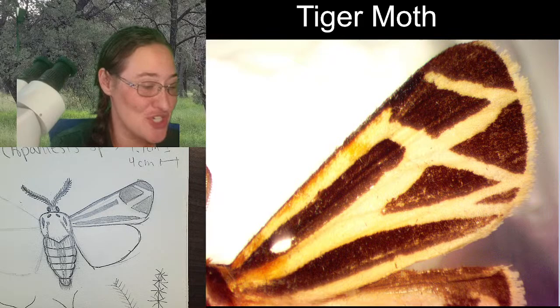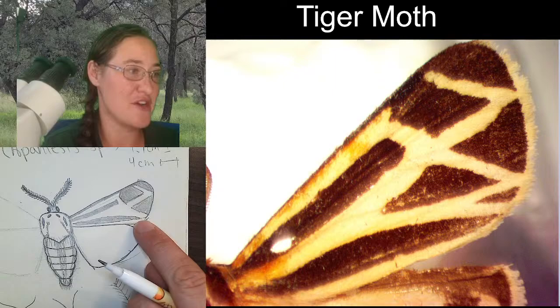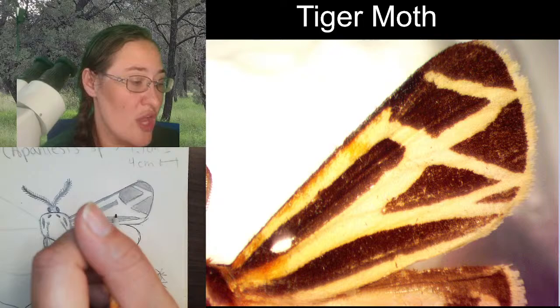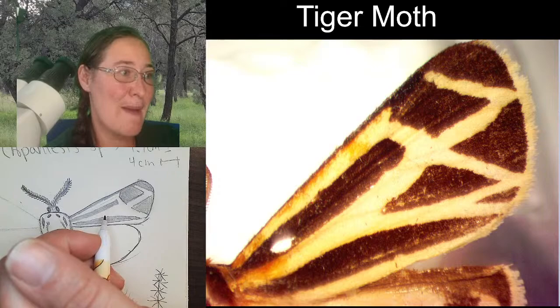But if I was just going to throw a guess out there into the ether about the fringe-like scales on the ends of the moth wings, I would imagine that while they are flying, they are kind of like blowing in the wind this way. And also, these are night-flying creatures, so they are trying to avoid bats. And I would throw out a guess that those fringed scales on the edges might mess up the bat sonar. That's my guess.